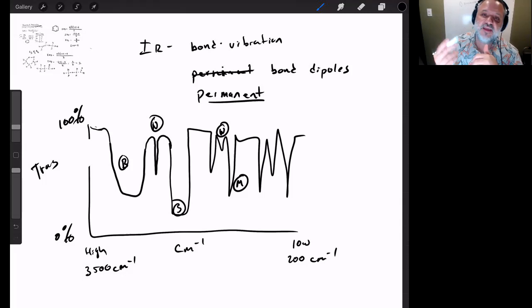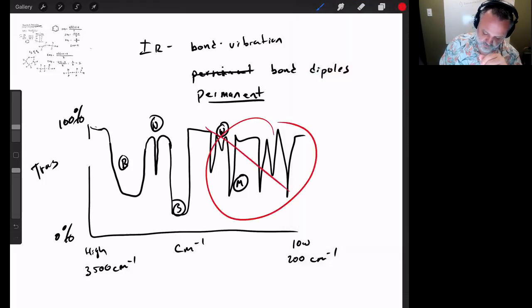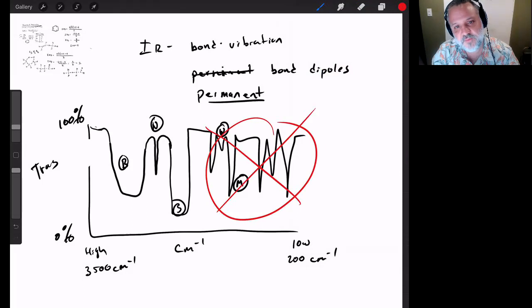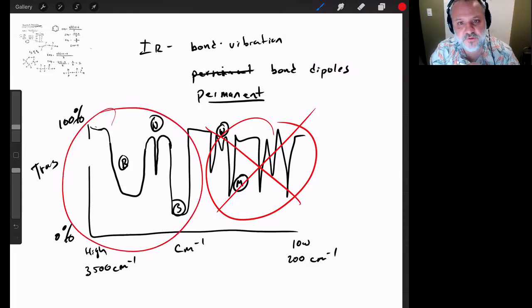And so let's take a look at this graph real quick. I'm going to show you on a more sophisticated drawing some of the same information. We're going to look at some actual spectra. And then once we flip over to IR, I'll actually use some, and we'll examine what we have. And so let's take a look. In general, there's no information on that side. In general, this is where all the information you get is. And so let's flip over and take a look at that.